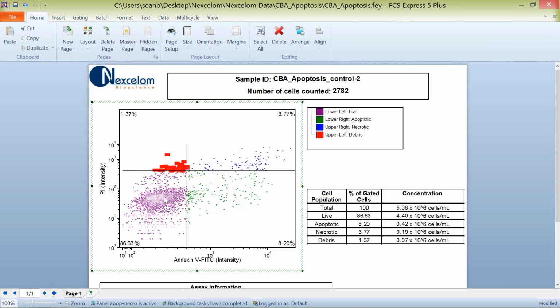So this is going to automatically give people a better idea of where the populations are focused, and if we had more cells in here, maybe in one of these populations, we'd be seeing that there too. You'll also notice in the upper left here that some of these dots appear very large and blocky.